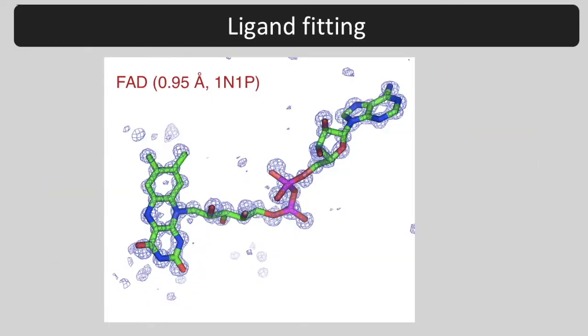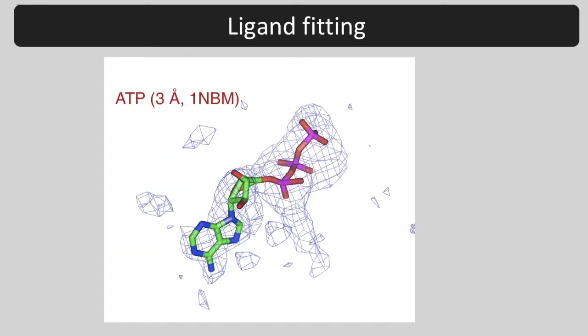The quality of your ligand fitting will depend a lot on the map. At very high resolution, you can see every atom. At low resolution, the ligand is just placed into a blob of density.